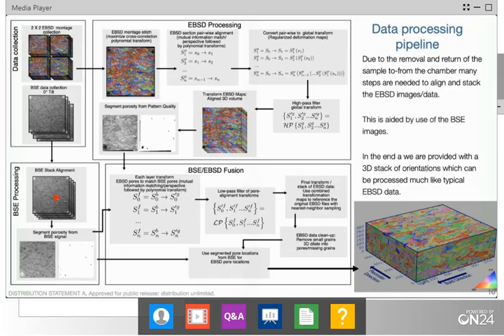If you look and stare long enough as a human, your pattern recognition engine will recognize certain similarities, but it's very difficult to get that to line up with the EBSD maps. Now, on the side of the EBSD maps, what we did is we first stitched all these maps together. We have an algorithm that will stitch these together and give a fairly seamless set of data.